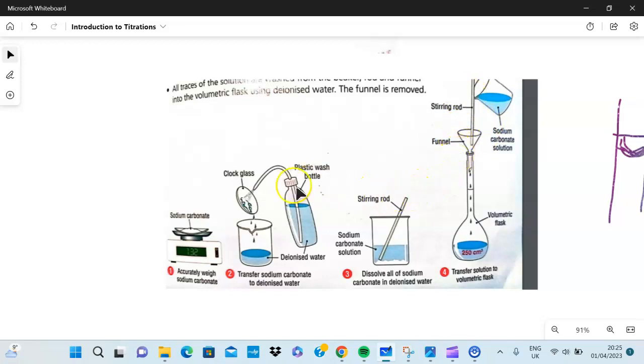Of course we add in more deionized water from this wash bottle to the beaker and add the rinsings down the funnel and rinse over again. Many people would say add in more deionized water, yes. You add more deionized water till about one centimeter cube below the graduation mark.